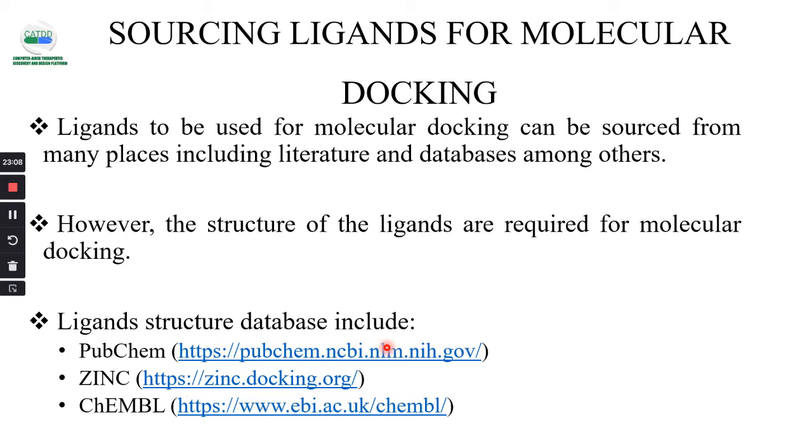But in the case of retrieving phytocompounds present in a particular plant, to get the information in one place rather than just searching for papers here and there, you can just go to the IMPPAT server that I mentioned earlier. You are going to have them there, but you have to go back to a database to get the structures of those compounds.